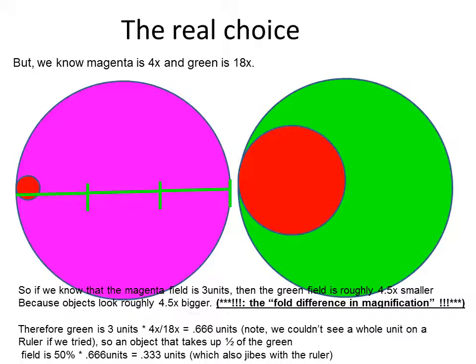So it's much easier for me to appreciate that, yet again, this is about 1/2 the size of the total reference, which is the high magnification field. So this is where we enter the messy calculations. If we can't measure the size of the high power field, then we have to calculate it.